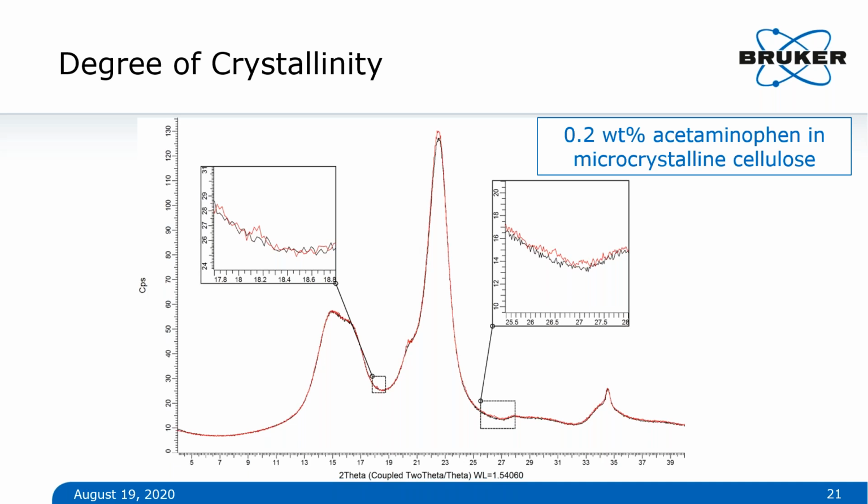So way back earlier in this presentation, one of the things that I mentioned was that sample rotation is standard on all of the diffractometers that Bruker offers. And one of the reasons why you want to rotate your sample is because you are then effectively tumbling your crystals, right? If you think back to that video that we saw with all of the cartoons, the Bragg condition is fulfilled at very, very specific angles. So you really need to have a crystal oriented in the right direction.